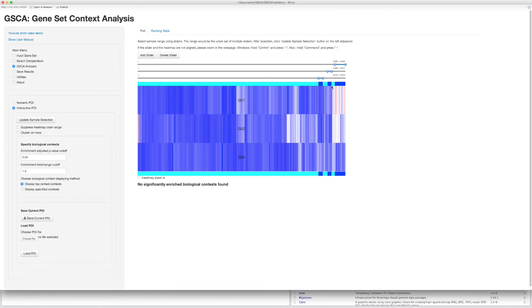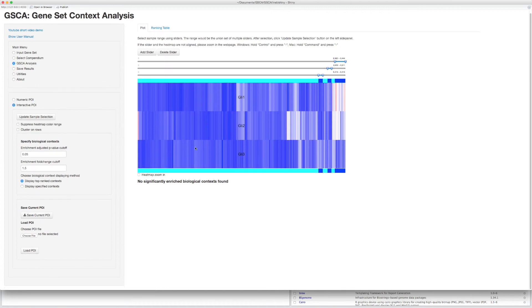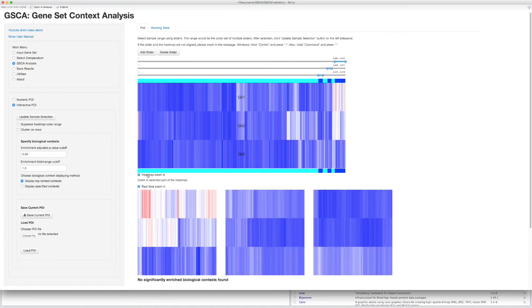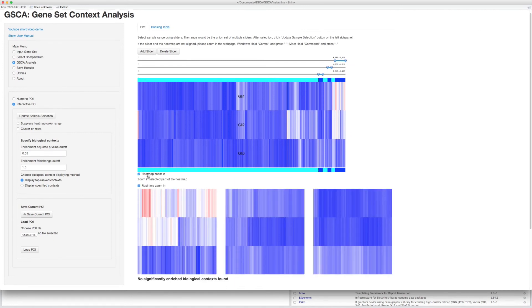You can add multiple sliders and the POI will be the union of all intervals. Again, samples indicated by dark blue are the selected samples. Sometimes it is hard to see a tiny part of the whole heatmap clearly. So you can turn on the heatmap zooming function. Now you can see the details of the selected parts of the whole heatmap.